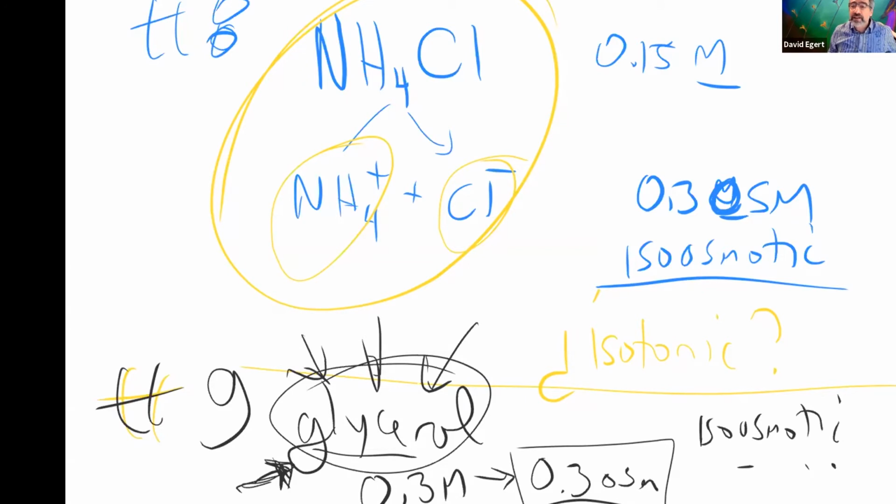So exactly what it's going to do, Maria, if it has enough permeability to get through the membrane and upset the balance, then what would happen? It would be hypotonic. Mhm. It can get through, but not so well. So by the time we spin it down, it hasn't had a chance to make it into the cell. What will we see? It'll stay isotonic. So here it matters actually.